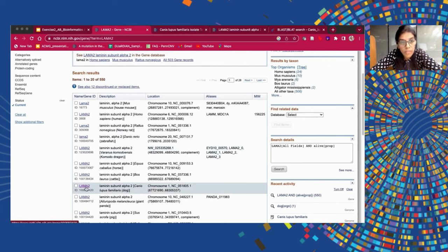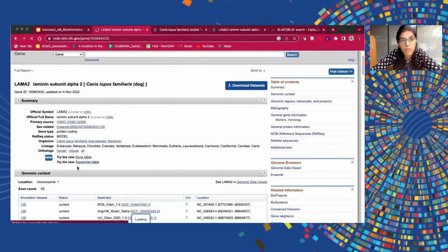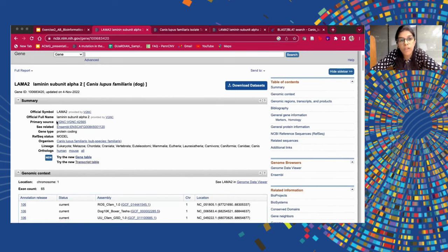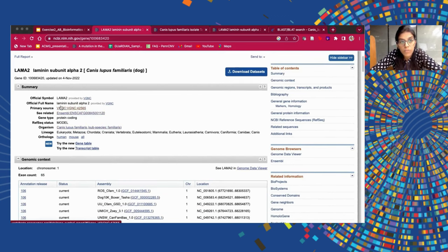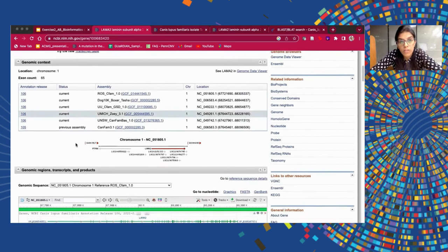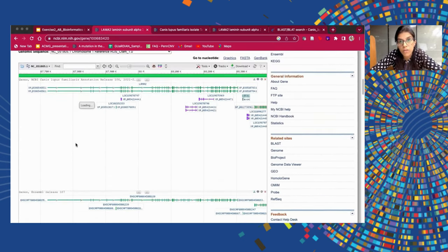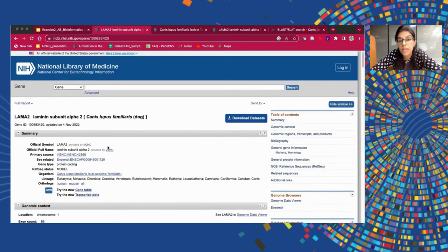Once you click on the Canis lupus familiaris entry, you will be redirected to a page with multiple pieces of information about the gene — like whether it is a protein coding gene, where it was first sourced, its official full name, what lineages it belongs to, whether it has human, mouse, or other organism orthologs, and what assemblies it is currently mapped to. We were interested in getting the FASTA sequence of this gene, so we just click on 'Download Data Sets' and a folder containing the gene FASTA sequence will be downloaded.